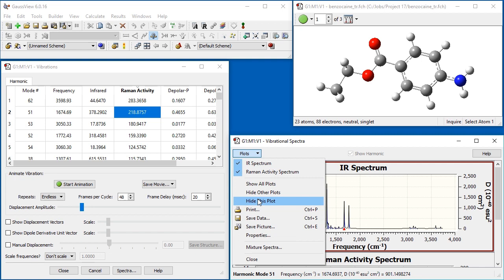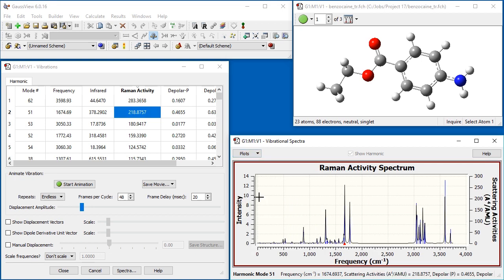we close the selected plot, which is the IR spectrum, using Hide this plot in the second section of the menu. Here is the Raman spectrum for our Benzocaine molecule.